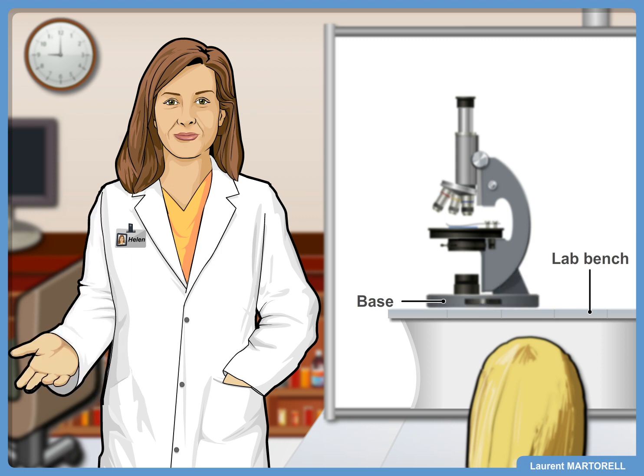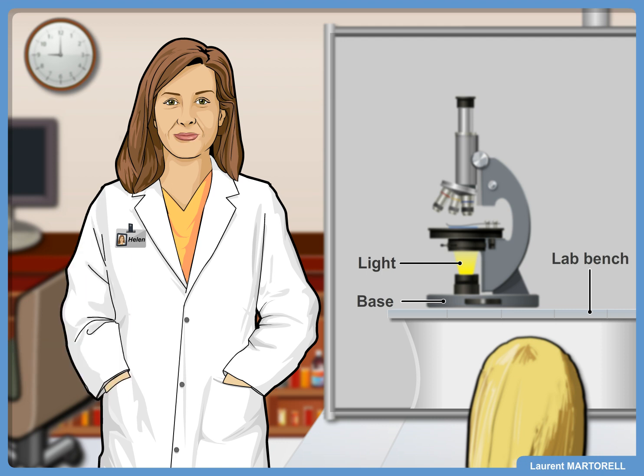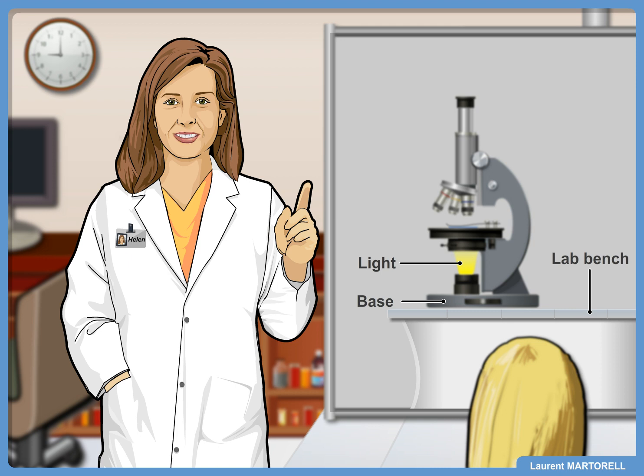One of the most important parts of a compound light microscope is the light source. The power switch is found at the base of the microscope, so make sure to switch it on. Sometimes you can adjust the intensity of the light using a slider.